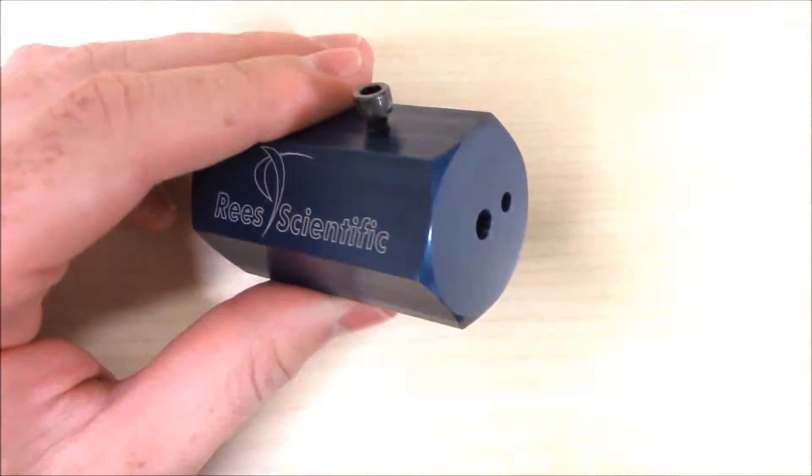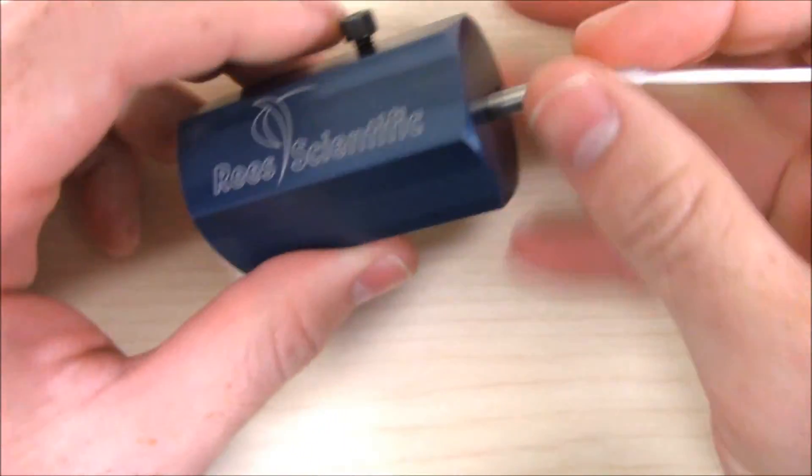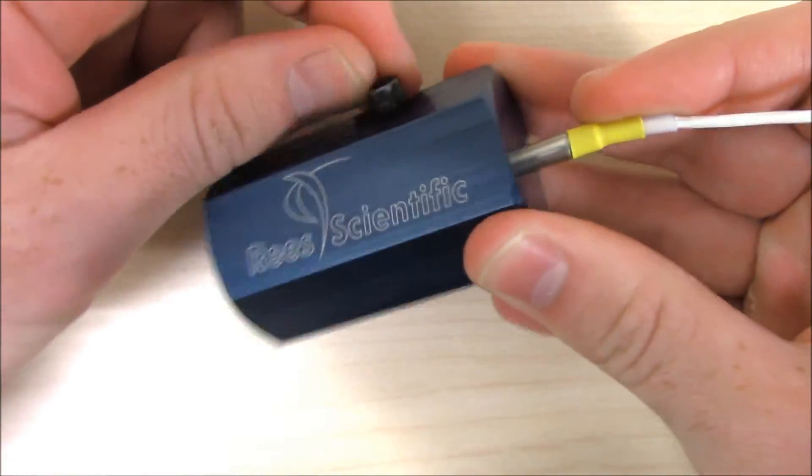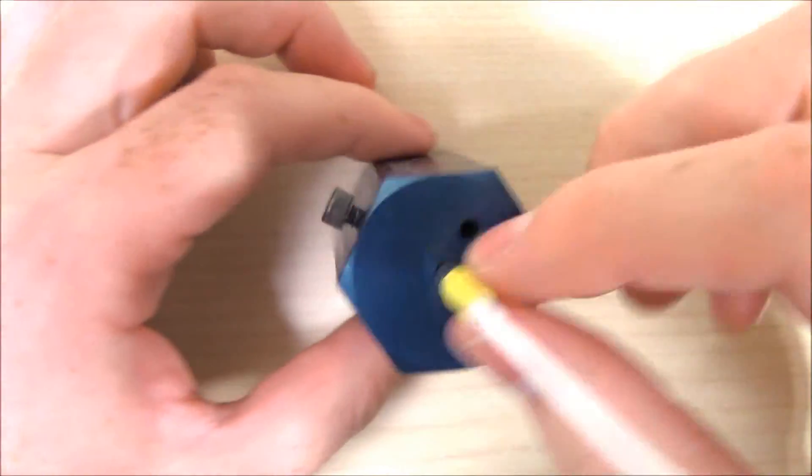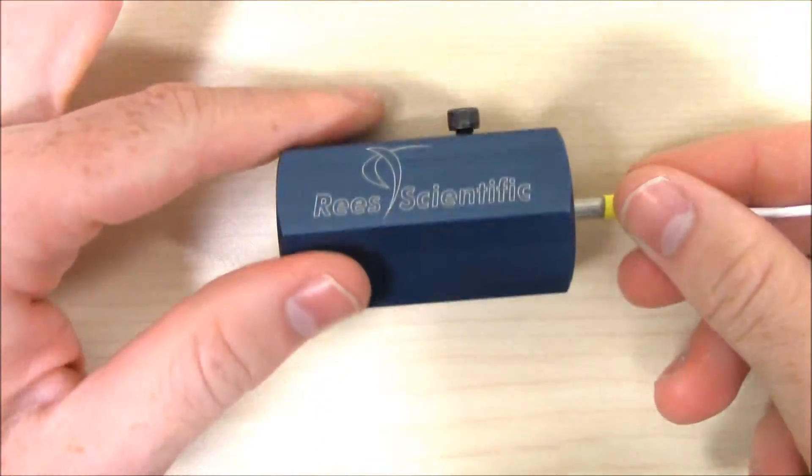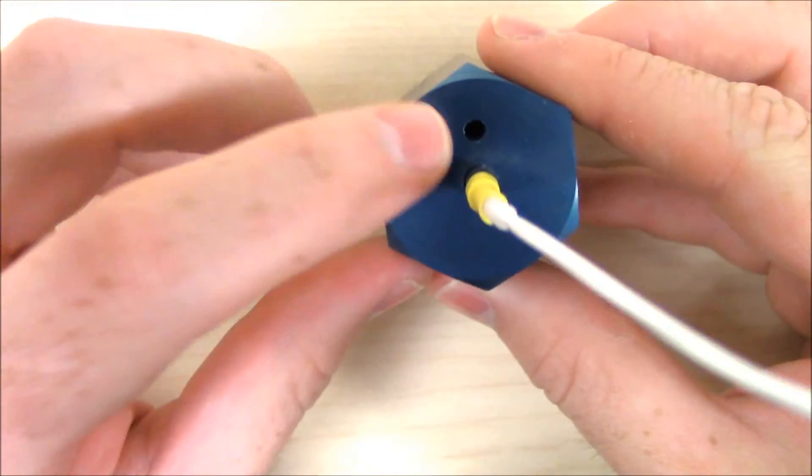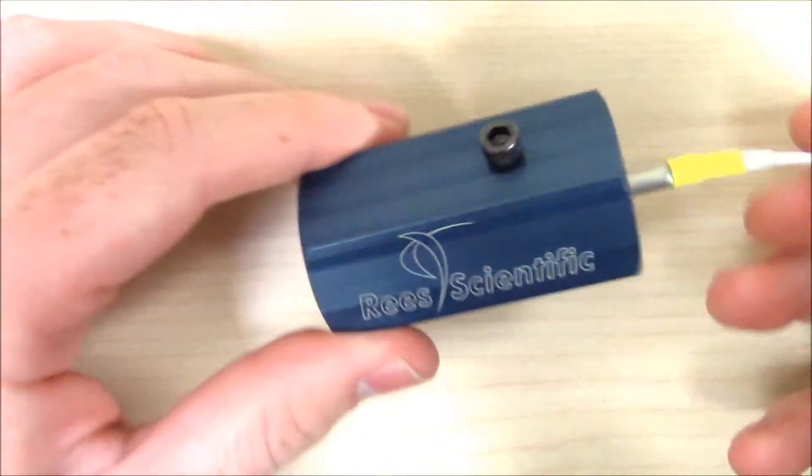Installation is as easy as turning the screw on the side to secure the end of the probe in place. A sturdy hexagonal prism shape allows for mounting in a variety of orientations, and it also features a secondary port for quick and accurate calibration.